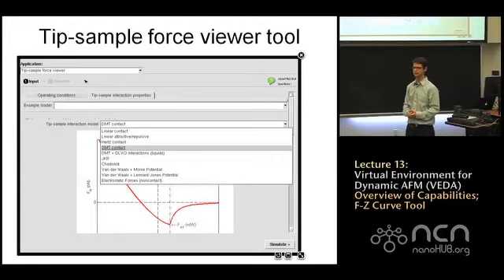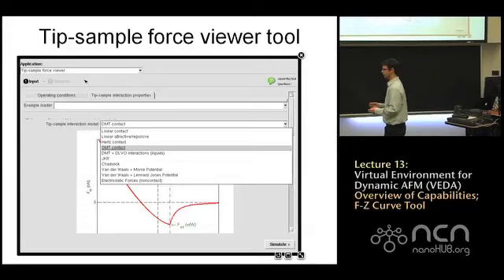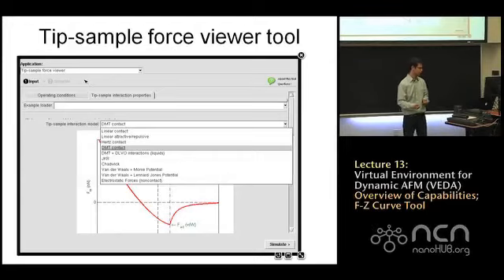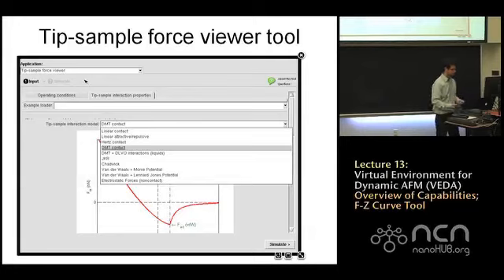This is how we're going to model the relationship between the position, the gap D, and the force exerted between the tip and the sample. There are several options here, depending on what the composition of the sample is, that help to model our experiment. Let's select the DMT contact model.